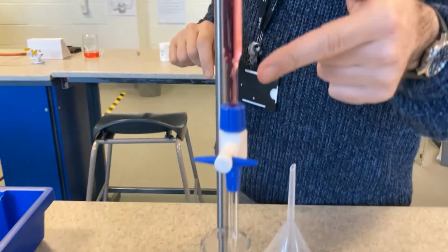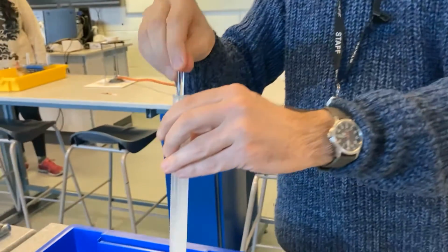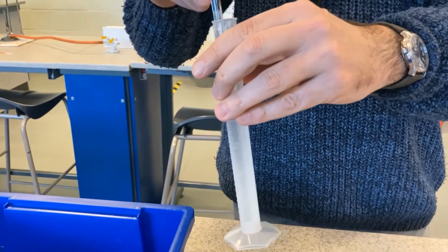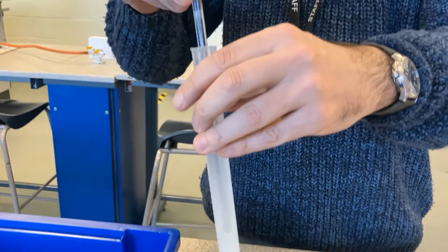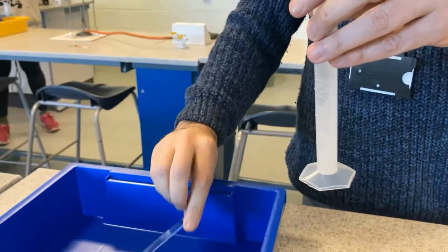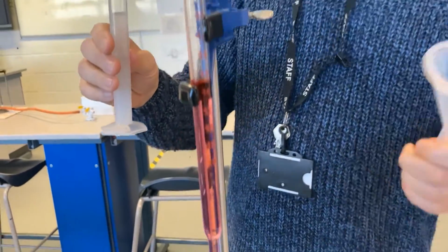Now, in here, you can see bright red, must be an acid, and I'm just going to add a whole load of alkali to it. Now, this is a special alkali. And I won't get into the science of it too much, but it makes carbon dioxide as well. So it should go bubbly.